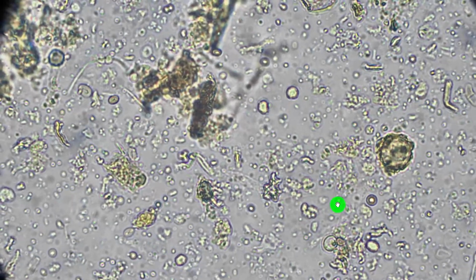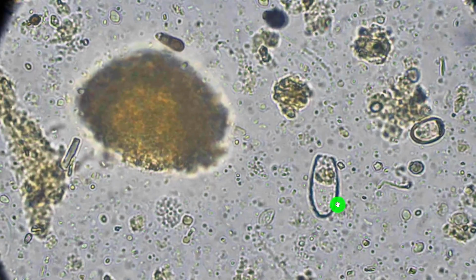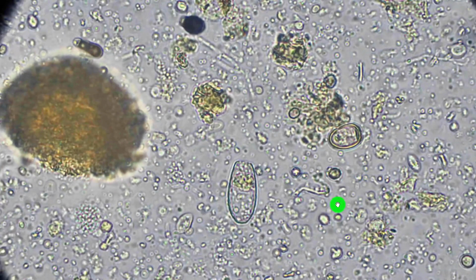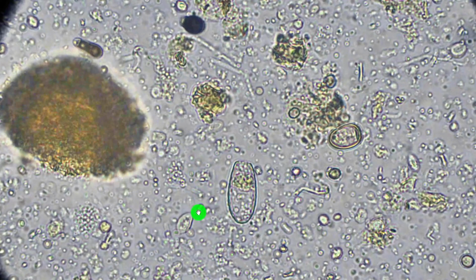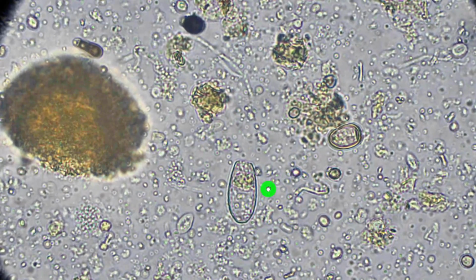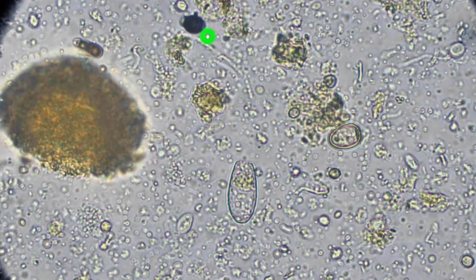And how do you get rid of them? You start drying the compost out. They will disappear on you. So I do not fear them whatsoever. And this compost is going to end up being fed to my worms. But going back to the bacteria, all these little things jittering in the background, little tiny dots, that's all bacteria. And these amoeba, all these testates, they eat that bacteria.